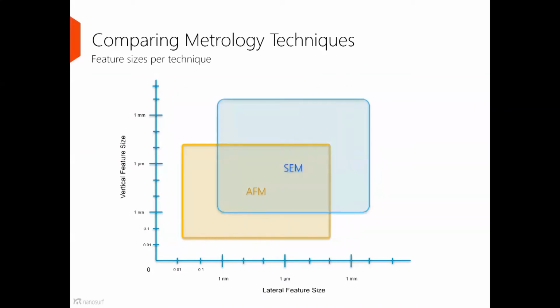If we compare that to the electron microscope, and you could probably even open these brackets on the electron microscope on the top and on the right hand side a little bit more, we can measure to a similar high resolution in the nanometer scale, certainly, but we can also measure objects that are much larger. I'm sure you've all seen the SEM images and art competitions where people will put, like, a grasshopper, or something that's actually macro scale in our eyes, or things we can actually tangibly touch, and we can still measure that with SEM with relative ease.